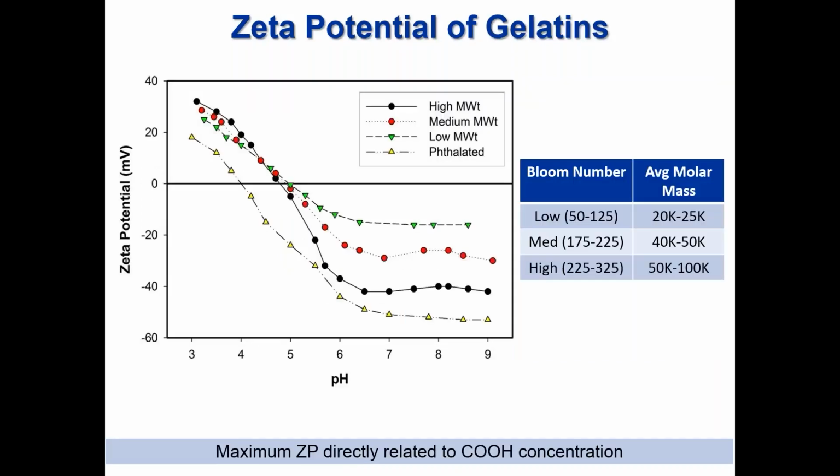Gelatin is a heterogeneous mixture of water-soluble proteins present in collagen, extracted by boiling skin, tendons, ligaments, etc. in water. The charge on the gelatin molecule and its isoelectric points are primarily due to the carboxyl, amino, and in some cases, the guanidino groups on the side chains. Factors such as molecular weight and number of functional groups impact the ionic characteristics of the gelatin. And the figure here shows 4 gelatins adsorbed onto PMMA beads. The zeta potential profile easily distinguishes between them.